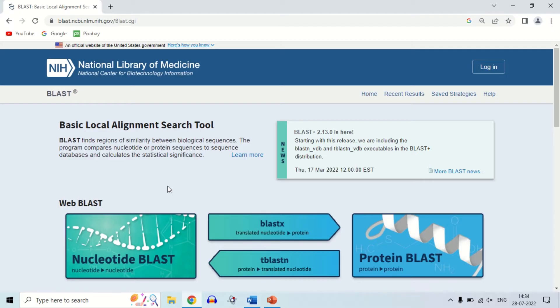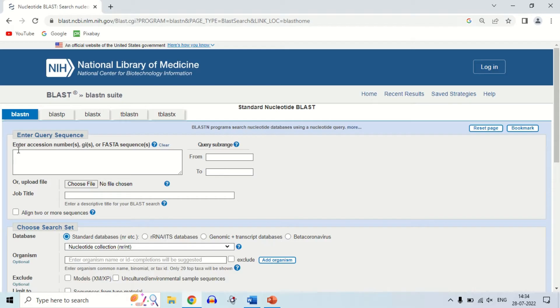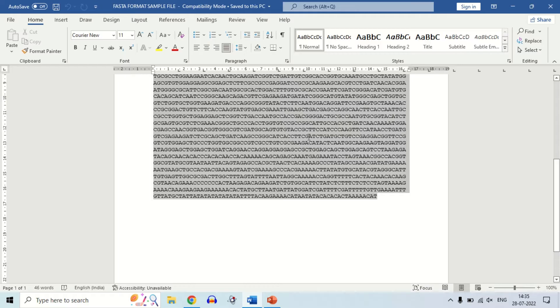To perform the nucleotide BLAST, just click on the nucleotide BLAST option. As I click on it, the next window opens. The first option is to enter the accession number, GIs, or FASTA sequence. You can give either the accession number of your query sequence or directly copy-paste the FASTA sequence. The query sequence is the sequence you want to compare with other sequences in the databases. I have already downloaded a FASTA sequence for demo purposes — now select the whole sequence and copy it.